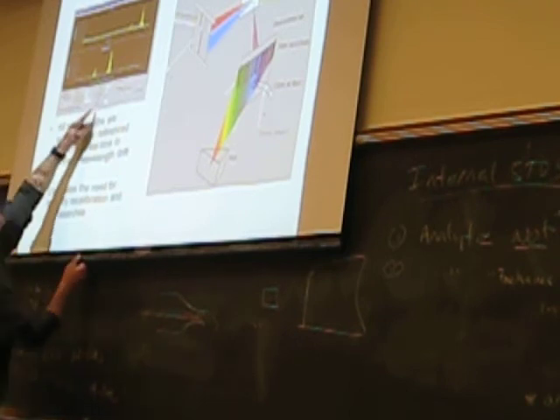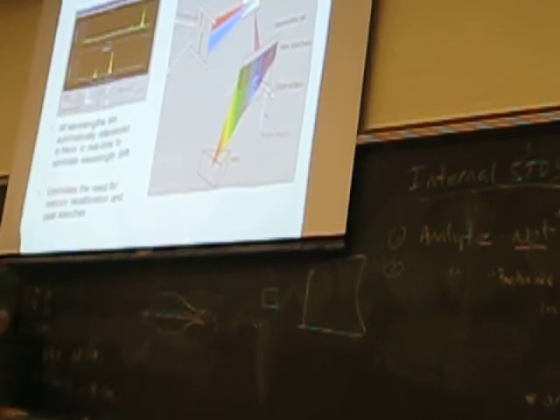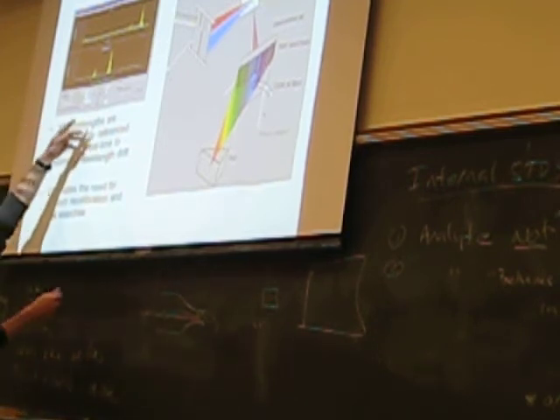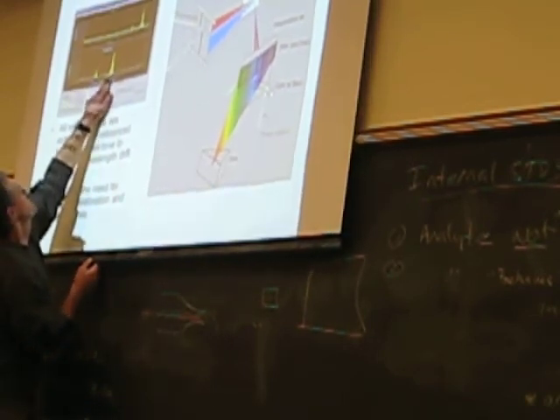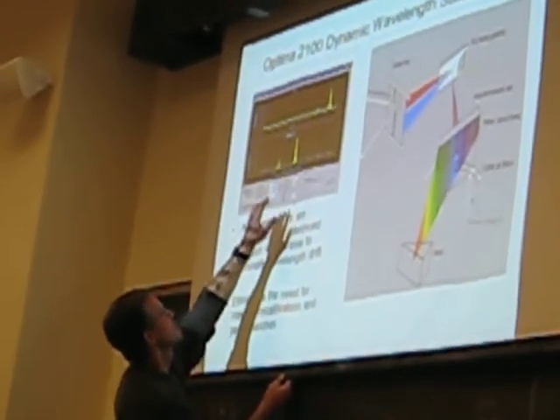Okay. And then what you are measuring here is the distribution of those photons in that pixel array, showing these 2 distinct Gaussian peaks. So it's showing that even at that fine resolution, we can distinguish 2 peaks of emission photons that we might want to characterize. He would go through and essentially align where you're going to count, because you don't want to count that, you want to count that. So he would say, I'm going to count just these 2 or 3 pixels here, and collect those counts over the course of my measurement of that sample or all the different samples. And you do that for each wavelength.